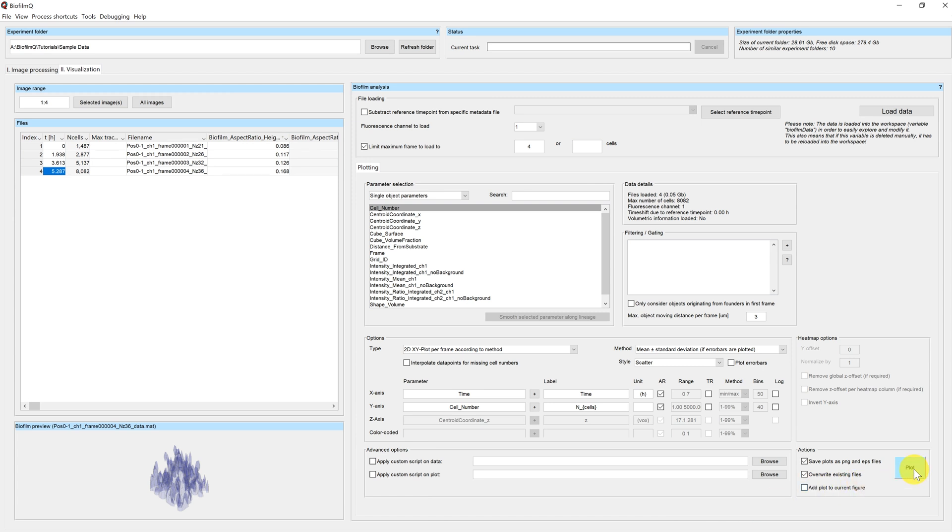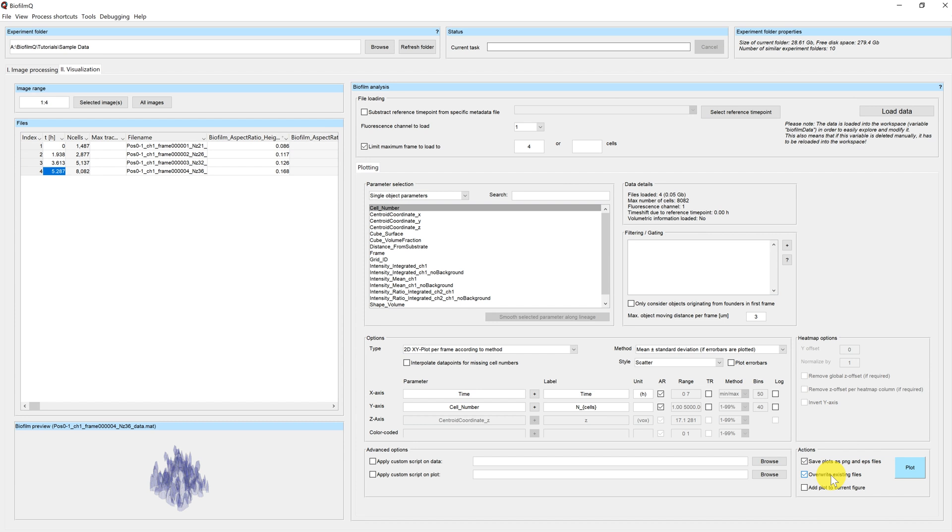Finally, by clicking on the button Plot, you can perform your plot. Before you do that, you should decide if you want to save your plot automatically as image files, in this case PNG and EPS, if you want to override existing files, or if you would like to add your plot to the current figure in case you want to plot several parameters into one figure.